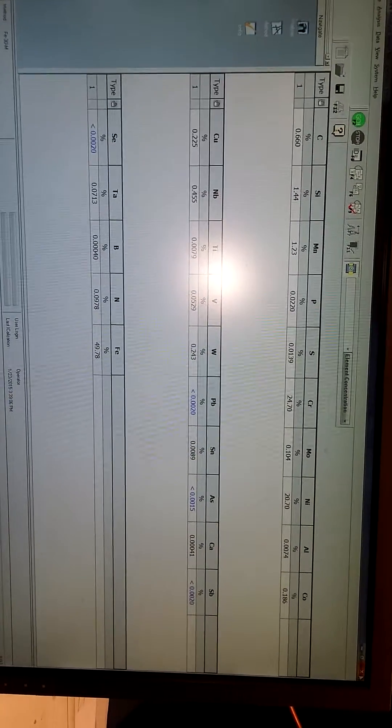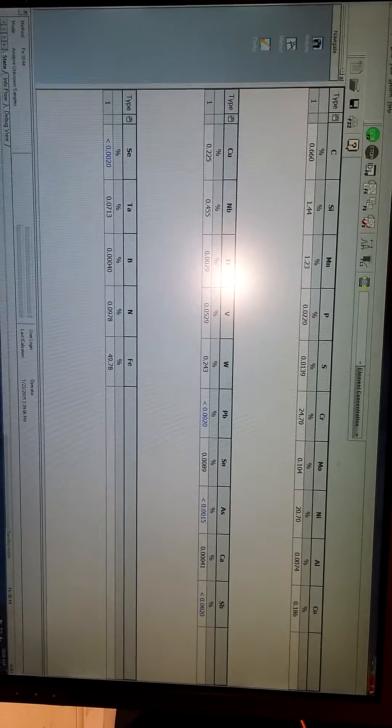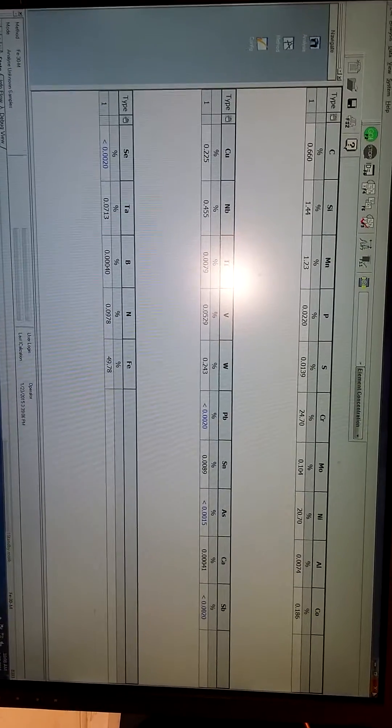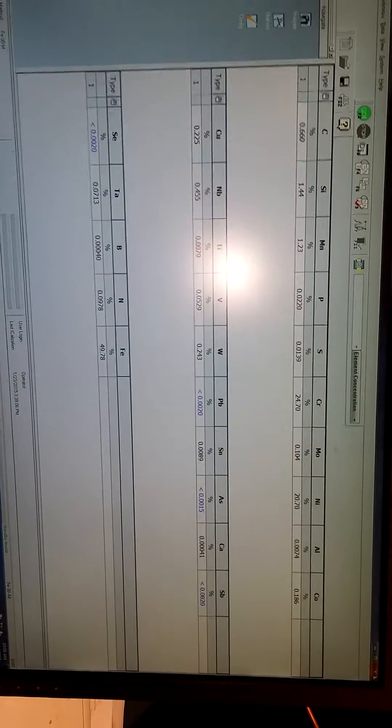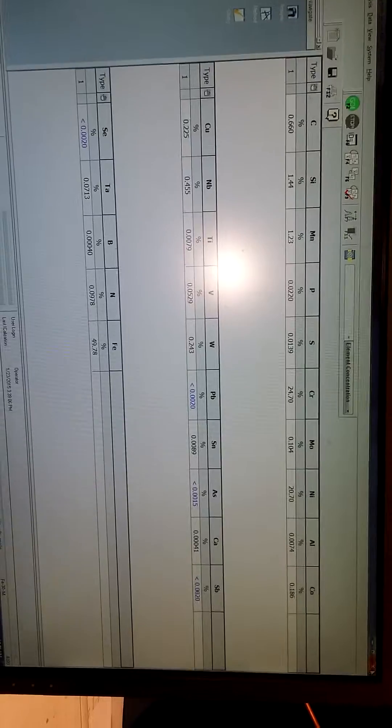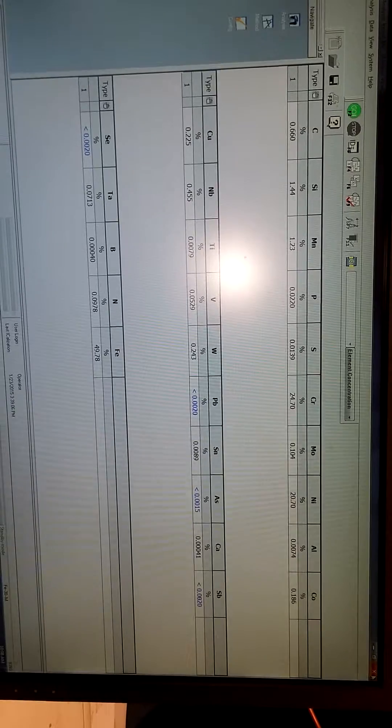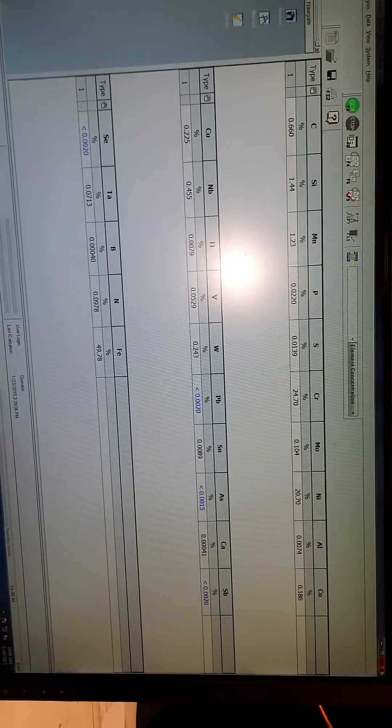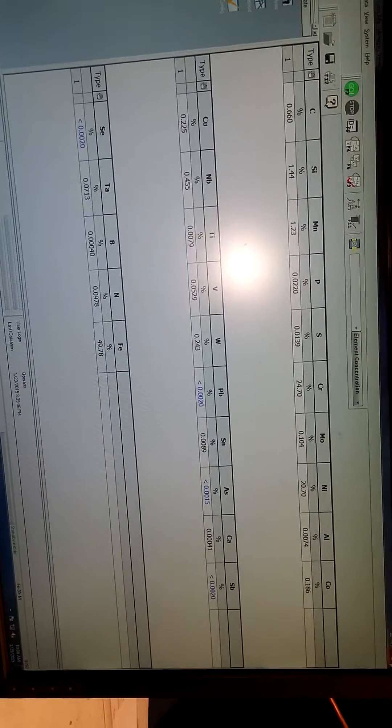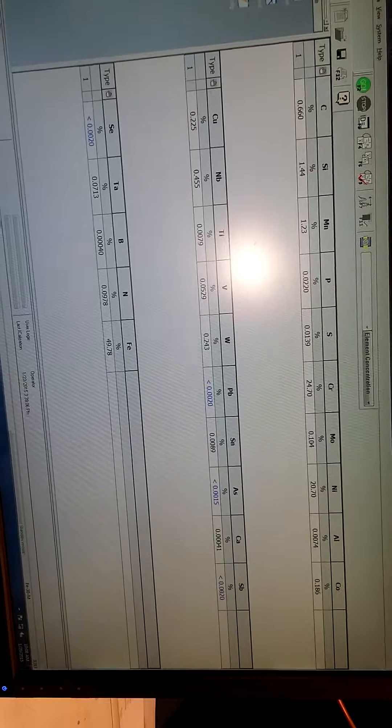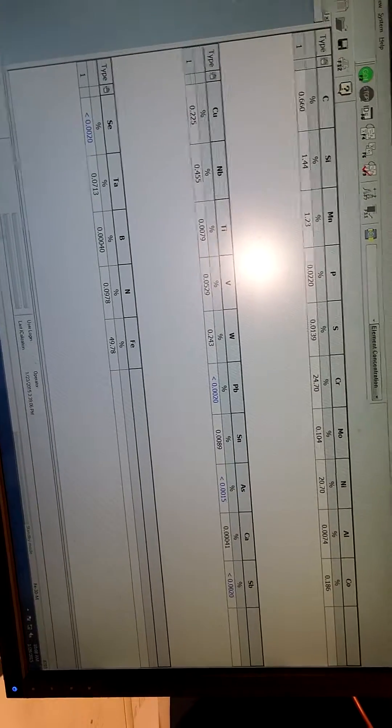Carbon's a 0.66 which is a little high. We want a 0.60 max. Silicon and manganese are good. Chrome is right where it needs to be. It's kind of on the low side. Nickel's kind of on the lower side too. Well actually it's in the mid.